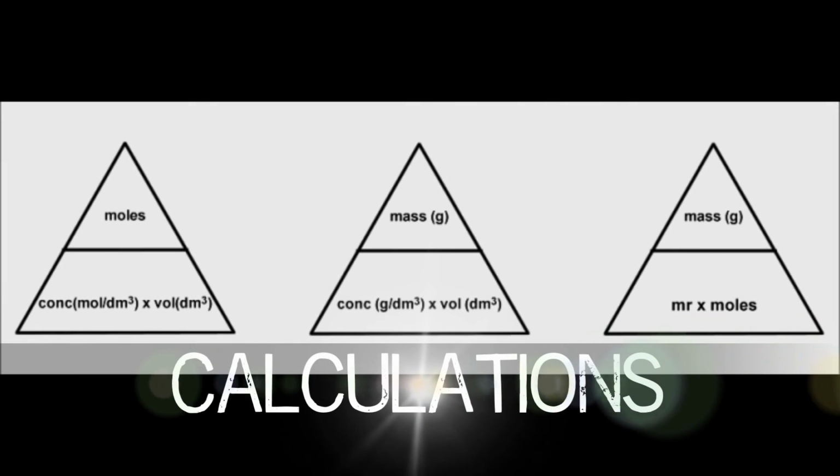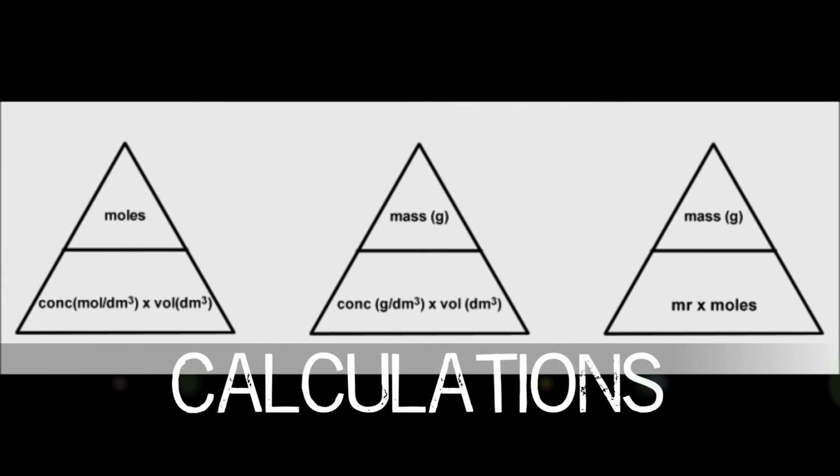Once all titrations have been completed, the concentration of the analyte can be calculated. This result is taken by averaging all results, excluding the first titration. Calculating the required concentration or amount of the unknown can be done by using the basic principles of molarity calculations.